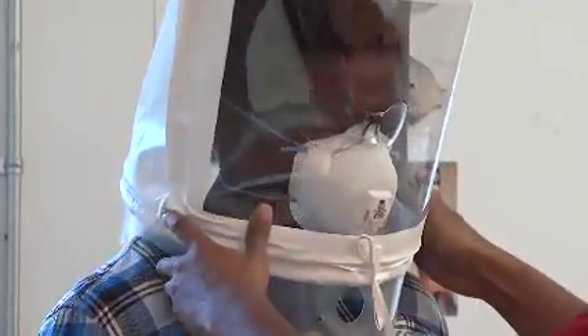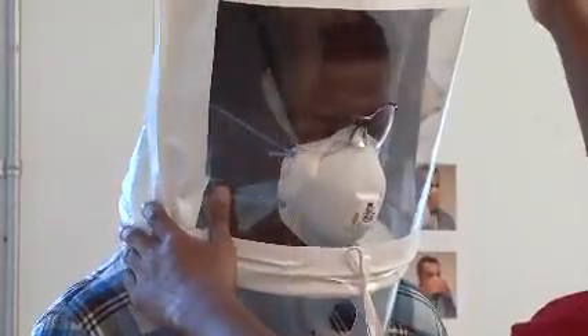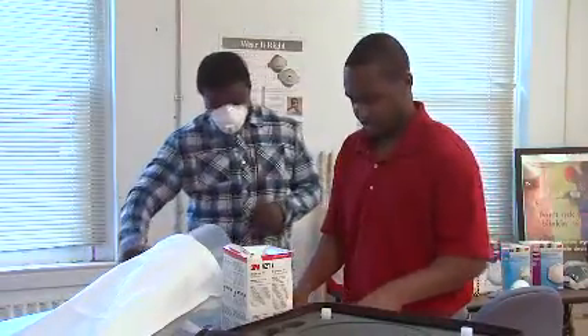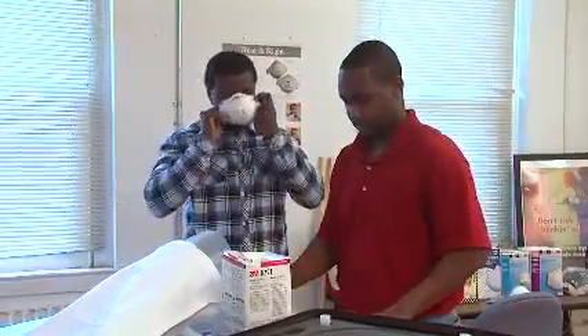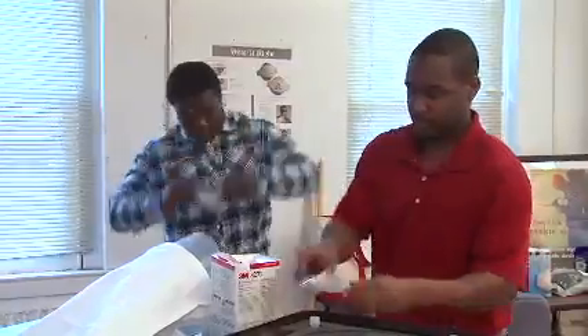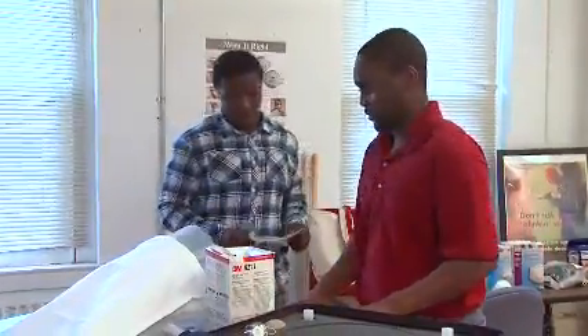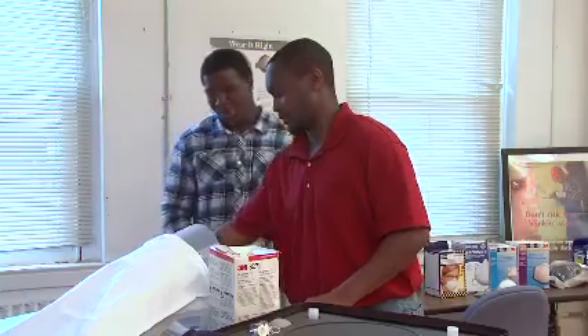Therefore, your employer needs to provide you with a reasonable selection of sizes and models to choose from. When you've completed the fit testing process, it's very important that you know which make, model, style, and size respirator fits your face properly, and when and where you'll need to wear it for protection.